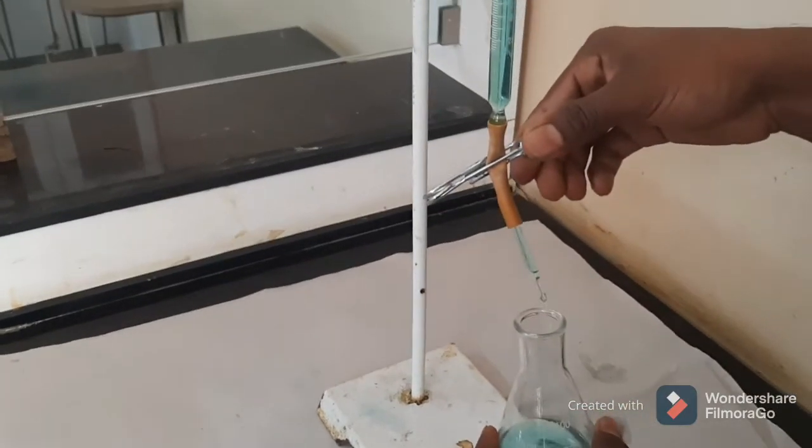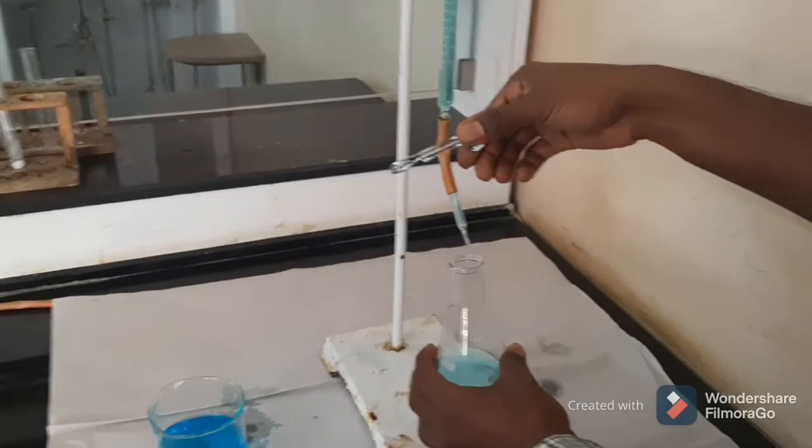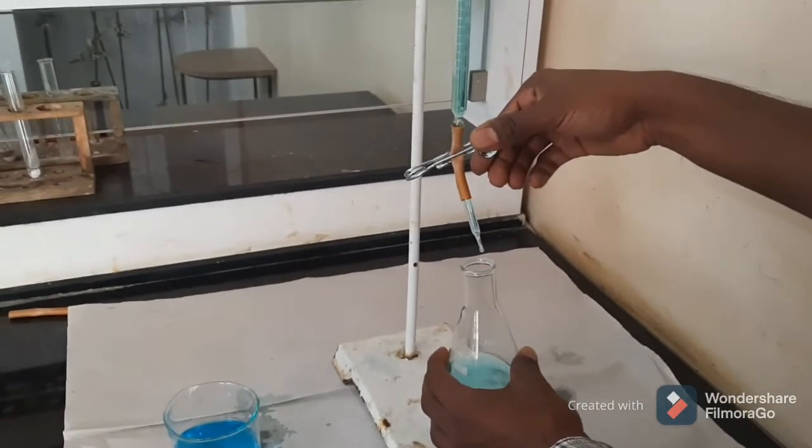In one hand you will hold the conical flask, and you have to operate the pinch cock with only one hand.